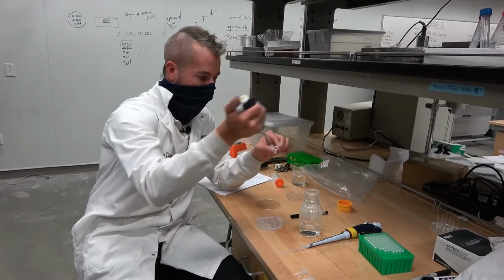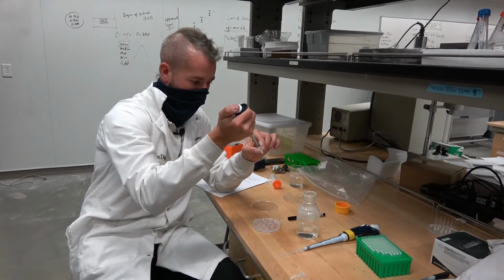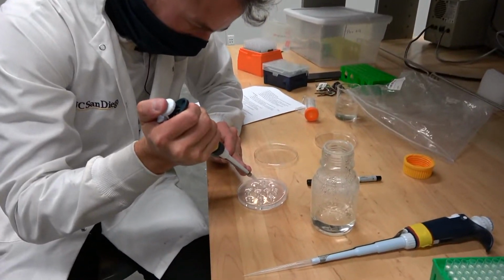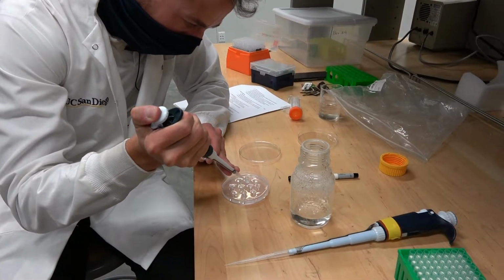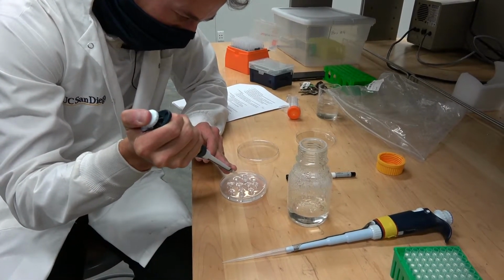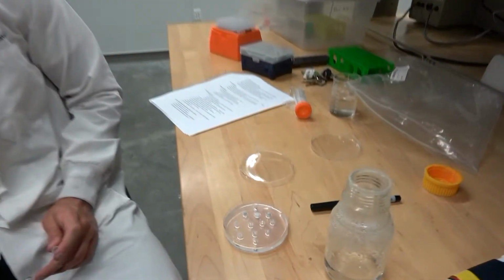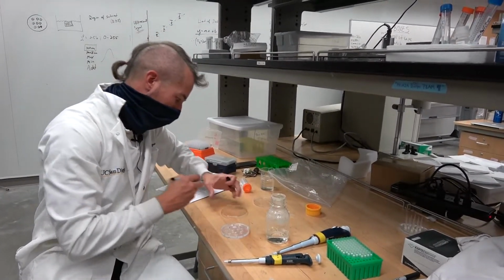Pull up 200 microliters, quickly mix it without having air bubbles, and then add it to the sample. That's a little bit too much. See, maybe you can see how I kind of spilled it off to the side, but not too bad. Okay, so.